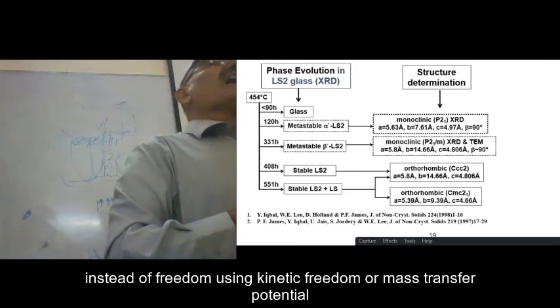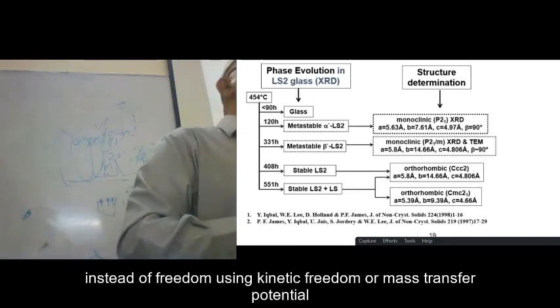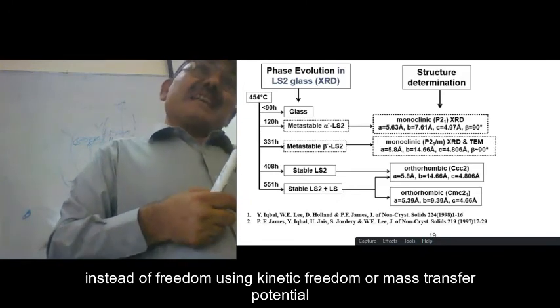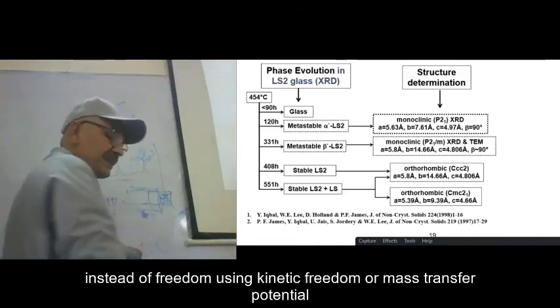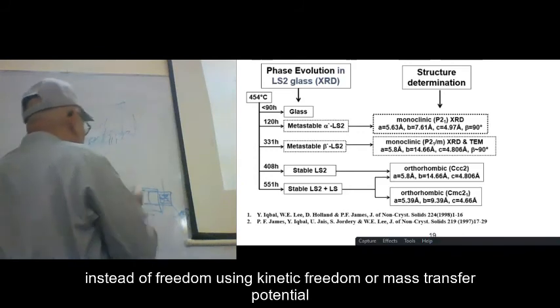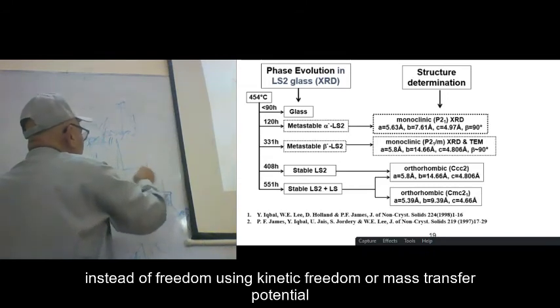When a large number of particles are there, it will give a statistical distribution of the crystals facing the X-ray beam, and it will give me more reliable information. Then I should expect that my X-ray diffraction pattern will be reliable and consistent.